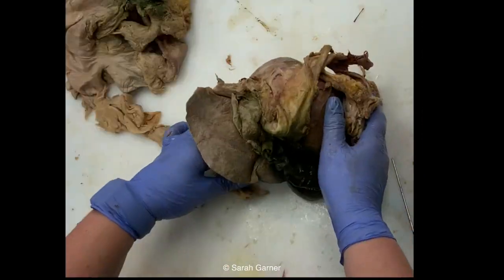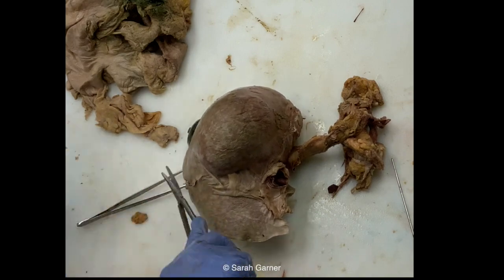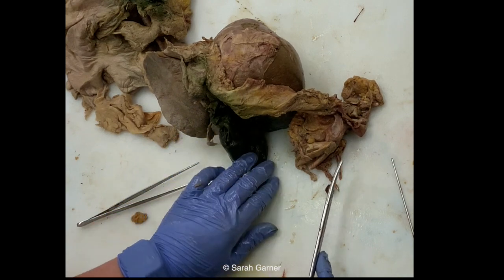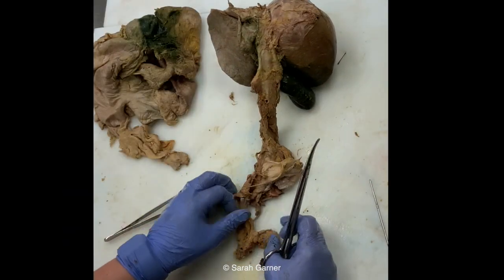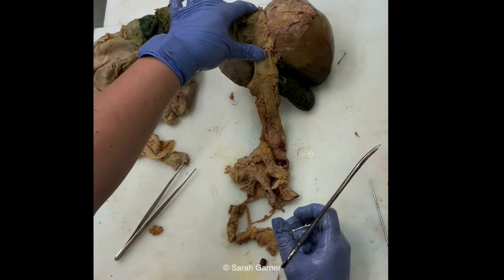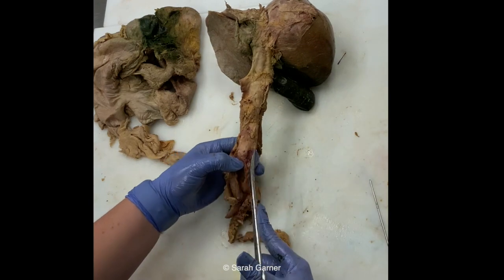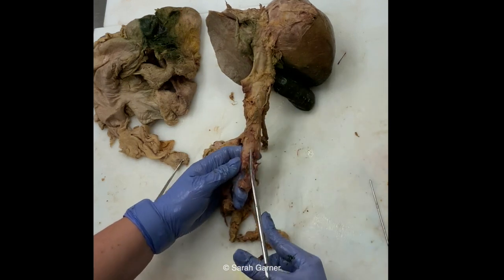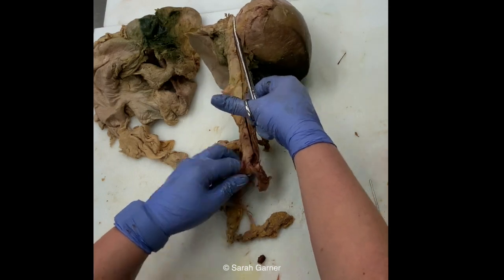So, doing the liver. You should clean it up, examine the outside, and we will section into it, but you want to make sure you're weighing it first. Now, do you want to weigh it with the big inferior vena cava attached? No. But when I cut things open, I like them to still be attached to something so you're not flailing around. If I detach the IVC right now and then try to open it over here, there's nothing holding it. I prefer to leave them attached until everything's open and clear. Plus then if you find something, you still have that relationship. I don't know if that's a personal preference or what, but basically I'm just opening up your inferior vena cava here.